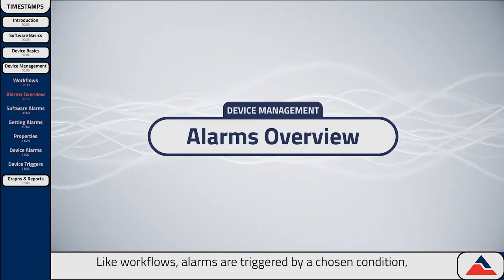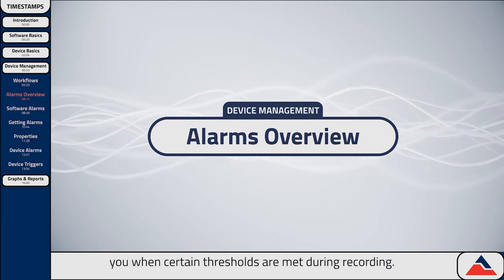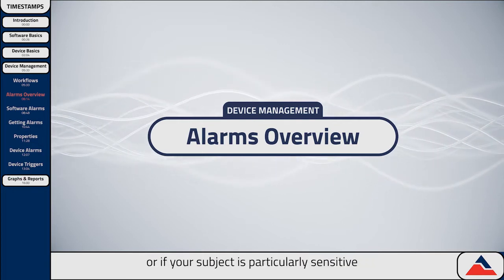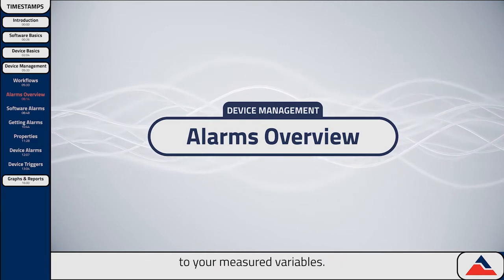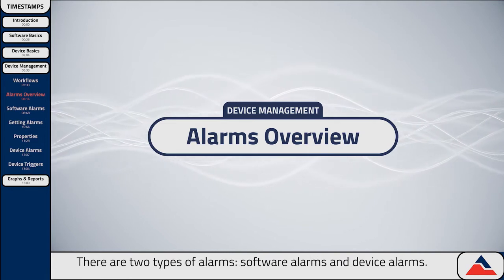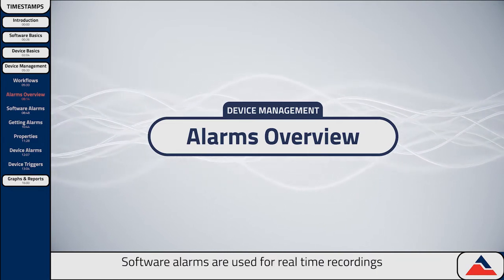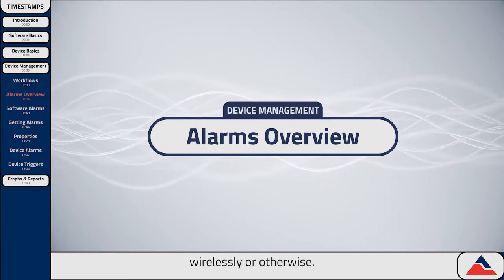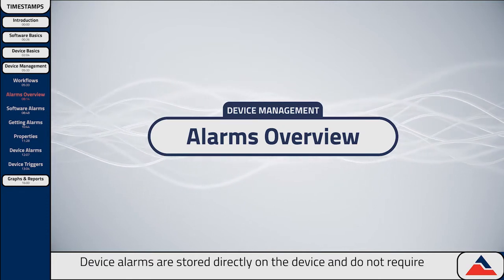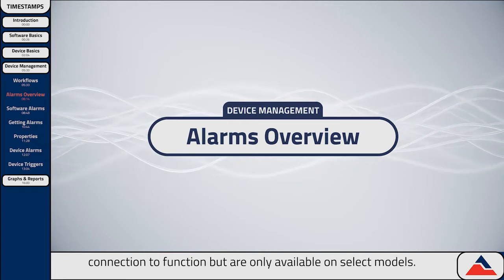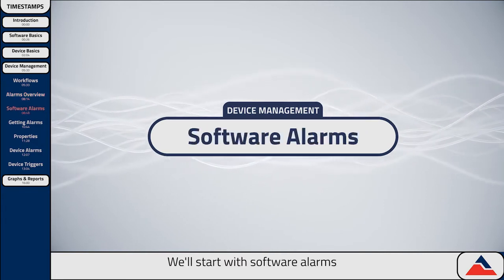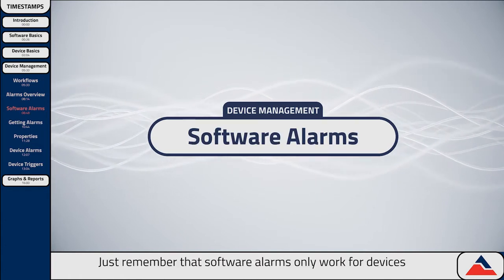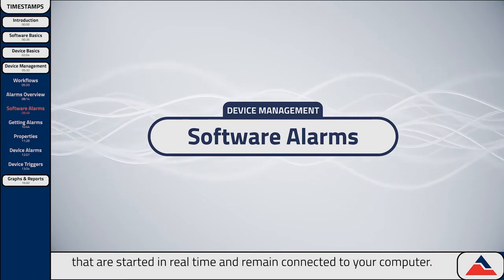Next, let's talk about alarms. Like workflows, alarms are triggered by a chosen condition, but are used to alert you when certain thresholds are met during recording. This is useful when the study must meet certain standards, or if your subject is particularly sensitive to your measured variables. There are two types of alarms: software alarms and device alarms. Software alarms are used for real-time recordings and only apply to devices connected to your PC, wirelessly or otherwise. Device alarms are stored directly on the device and do not require a real-time connection to function, but are only available on select models.